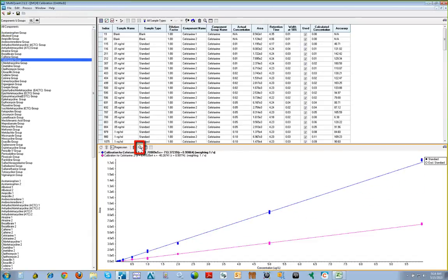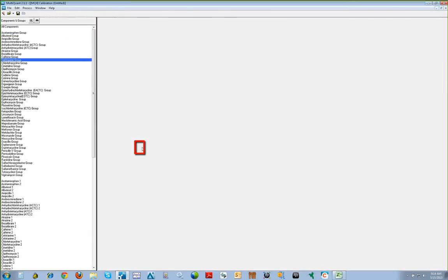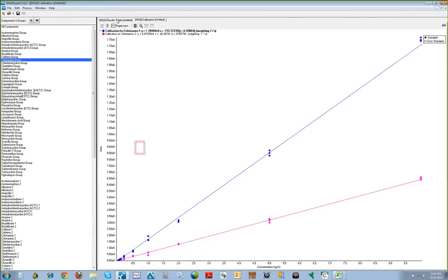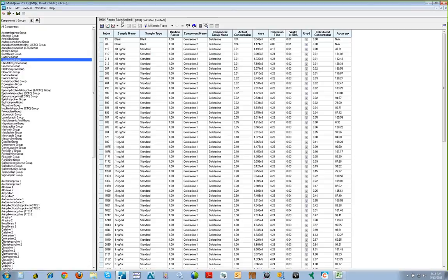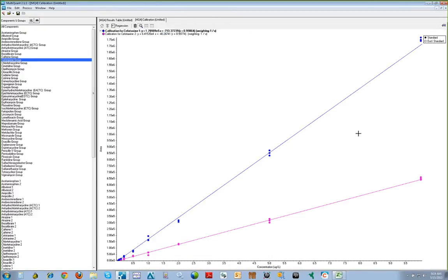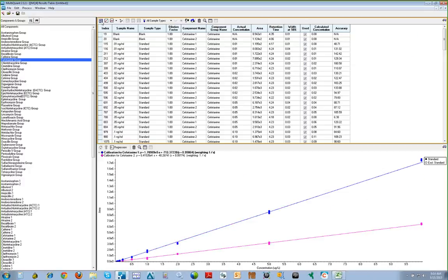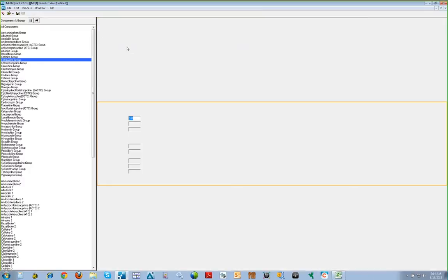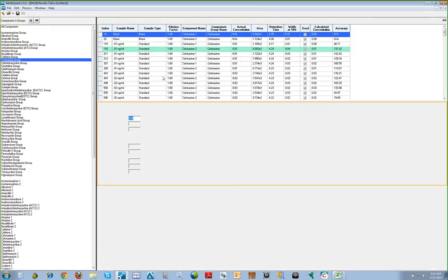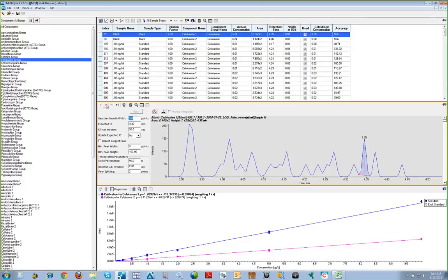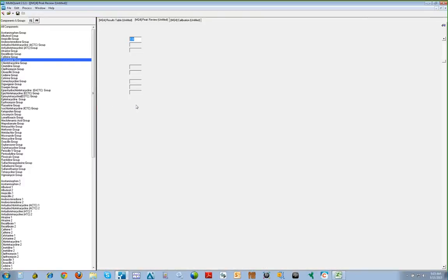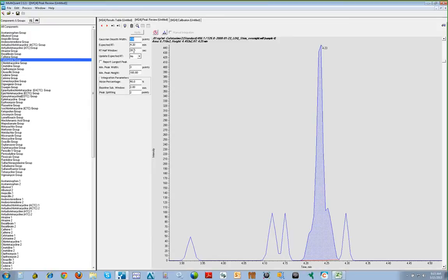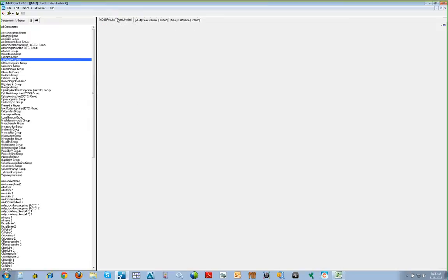By clicking the Magnifier button on the pane, we are able to change the view to create a unique tab for each pane for a different view of the results. We can also reselect to view the chromatogram pane, then magnify to review each pane as a separate tab.